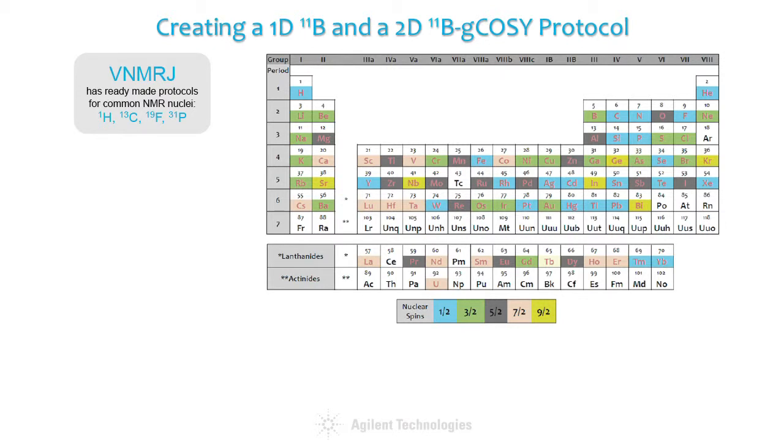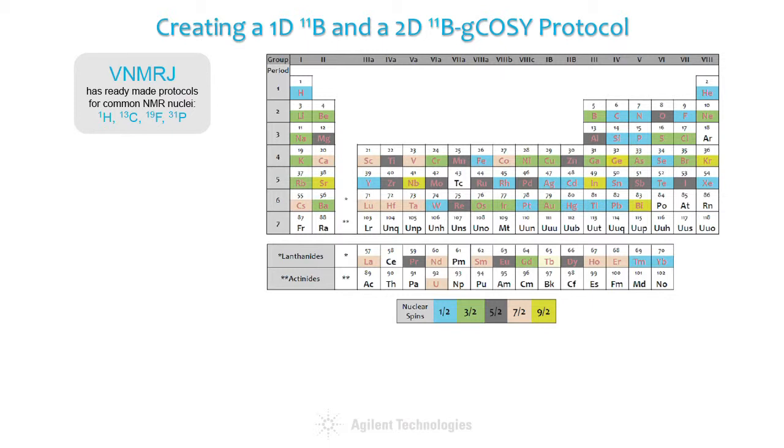Protocols to set up NMR experiments for the common nuclei are readily available in VNMRJ and can conveniently be accessed via the experiment selector. However, it would be impractical to supply protocols for every NMR active nucleus in the standard software and populate the user interface with buttons the operator will never need. Instead, VNMRJ3 supplies a set of very easy and robust tools to allow customers to add protocols to detect their favorite nuclei or set up different pulse sequences with those nuclei involved.